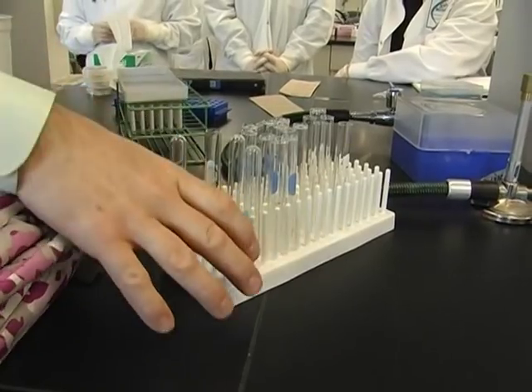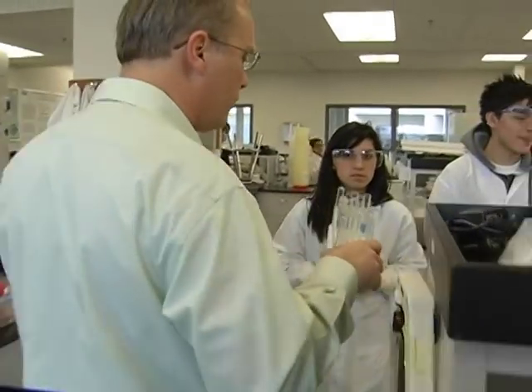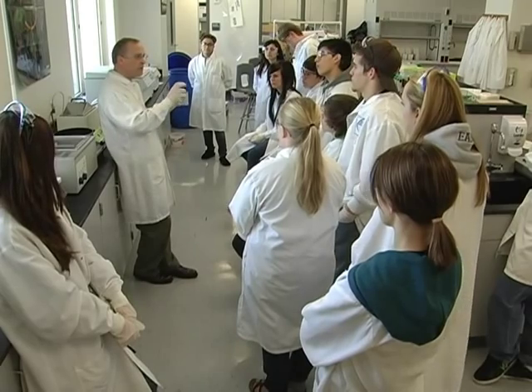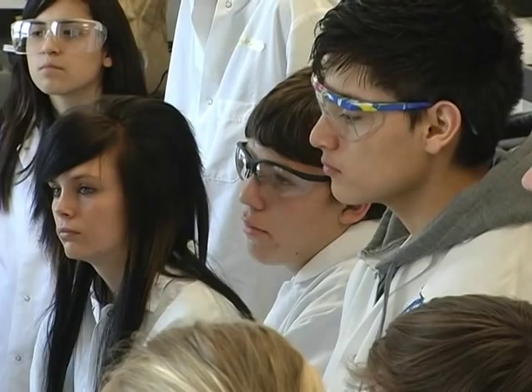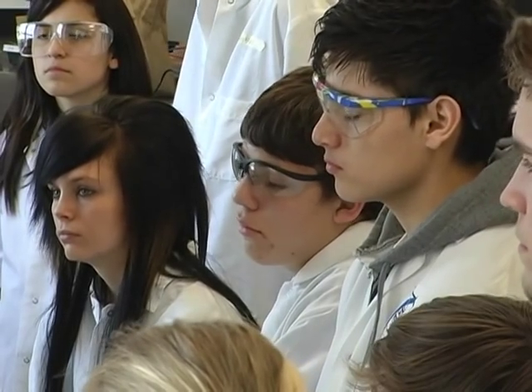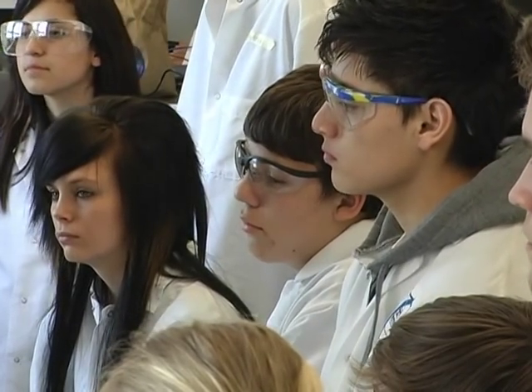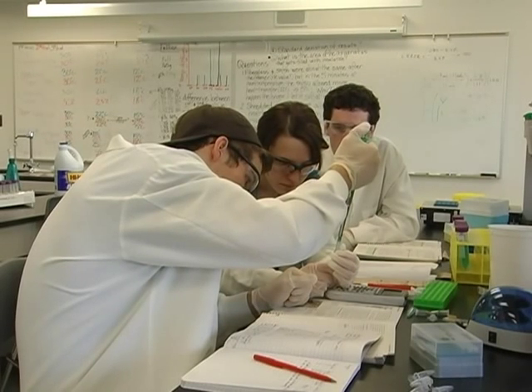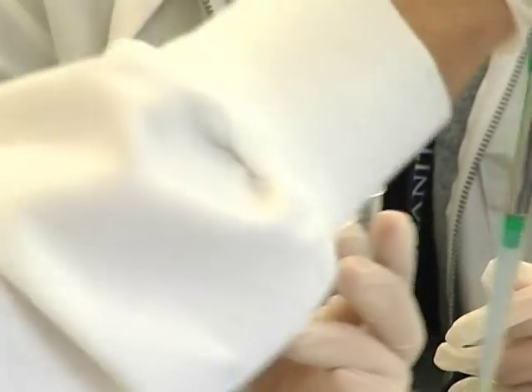Jonathan Tuttle instructs these advanced high school students in the terminology, procedures, and the use of laboratory equipment. My first objective is to help them become proficient at using the equipment in the lab. It makes them more comfortable in lab settings, and gets them to the point where regardless of the lab — whether it's engineering or chemistry or whatever — they would just feel more comfortable navigating in a lab setting.